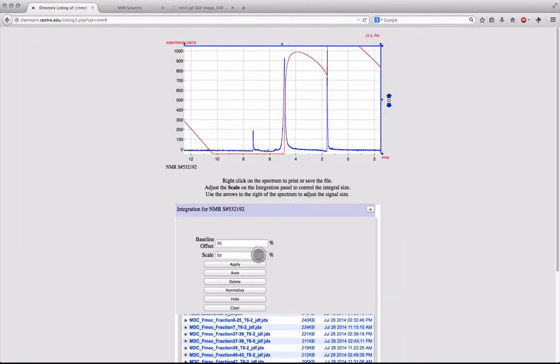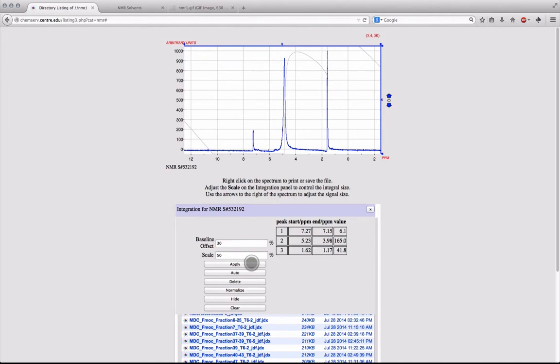By clicking the apply button in the menu, the signals within the spectrum will automatically be integrated, and the signal matching chloroform can then be removed.